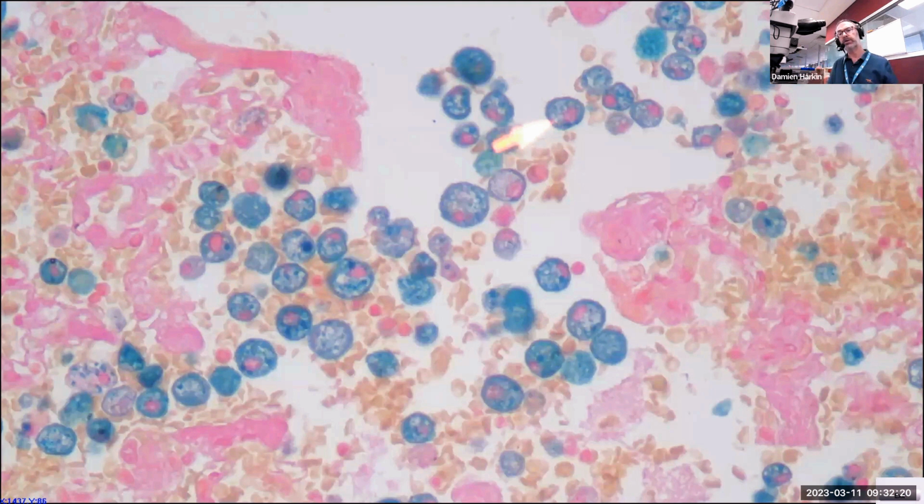But then what Chris has also applied here is a Van Gieson stain as well. So remember the acid fuchsin, the pink dye that we see here, is partitioning out into relatively larger open spaces like collagen. Seems to be staining a bit of the cytoplasm as well.